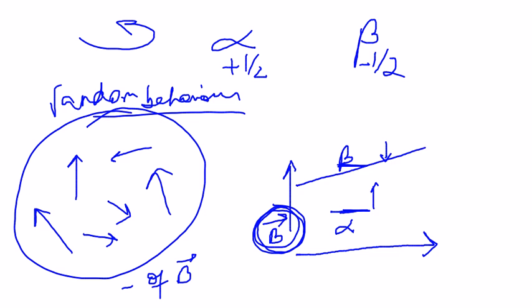So you are looking for that particular magnetic field at which the two, on application, are going to resonate, and that's what we are looking for.